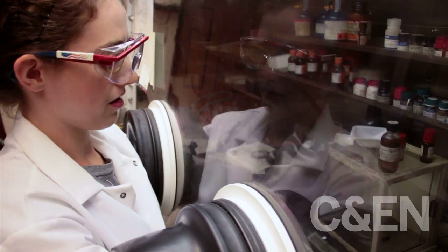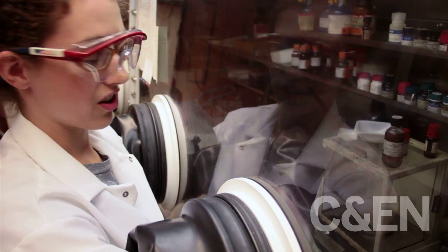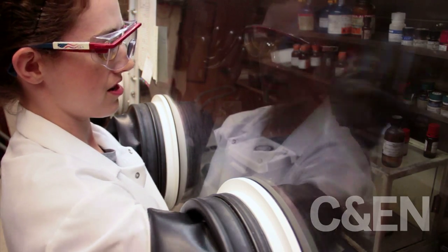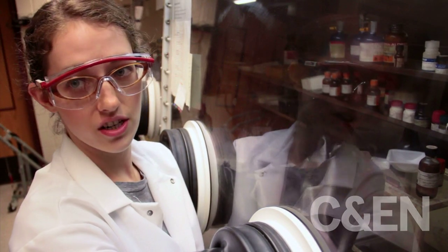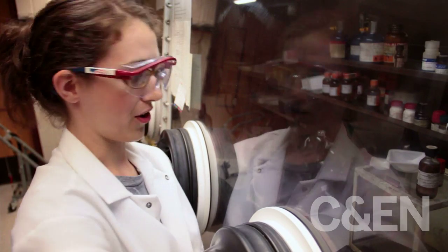First I'm just measuring the selenium powder — selenium is the component that we add in excess. Now I'm going to dissolve it in the TBP. When I dissolve it, it's an exothermic reaction, so it heats up a little, but not to an unbearable amount. It takes a little bit of mechanical stimulation to get this to dissolve, so I just shake it up. Now I'm going to split this between two syringes so that we can inject it faster and so that everything is injected more at the same time, and therefore it will grow to be about the same size.